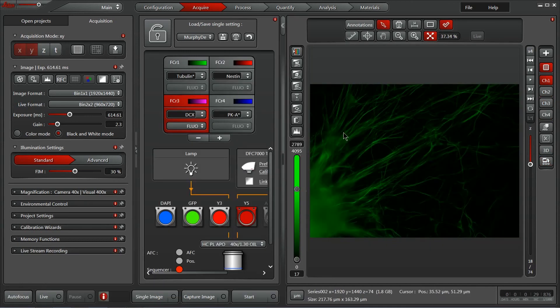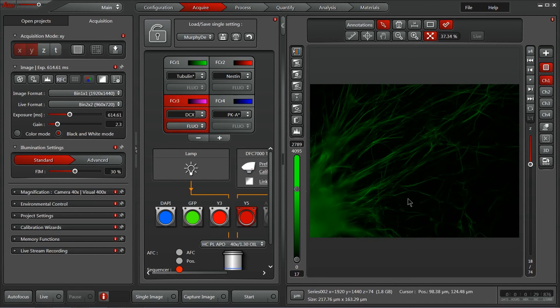And now let's have a look at the buttons across the bottom of our acquire tab. We've got a live button, which will begin the live feed from the camera and display it here in our image display panel on the right.